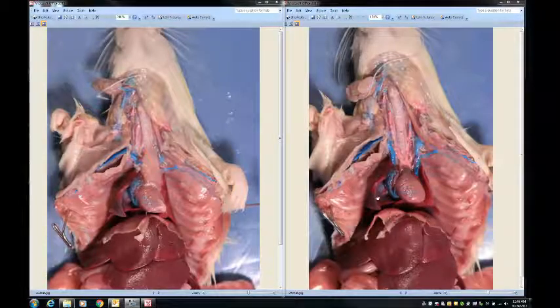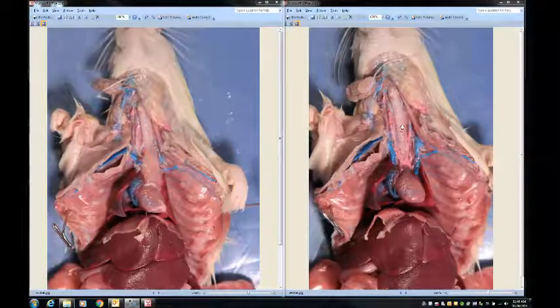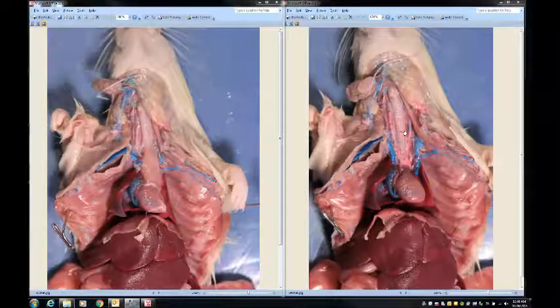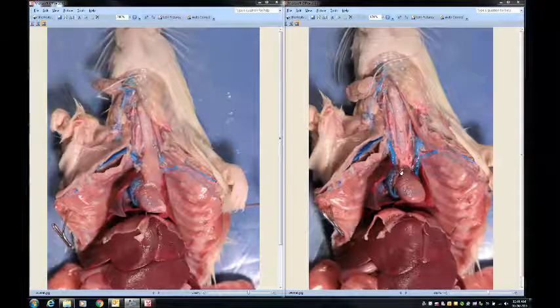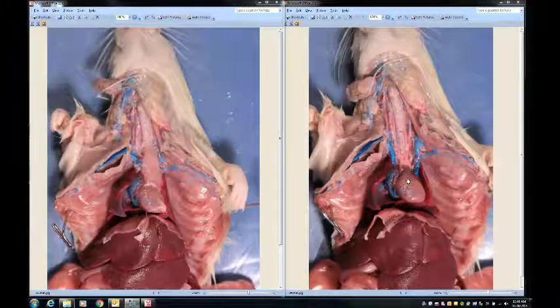To review: we have the diaphragm — that flimsy-looking muscle — the lungs, the heart ventricles, the heart atria, the trachea with its cartilage rings, and right here you can also see part of the aorta, which is one structure of the heart you will need to identify.